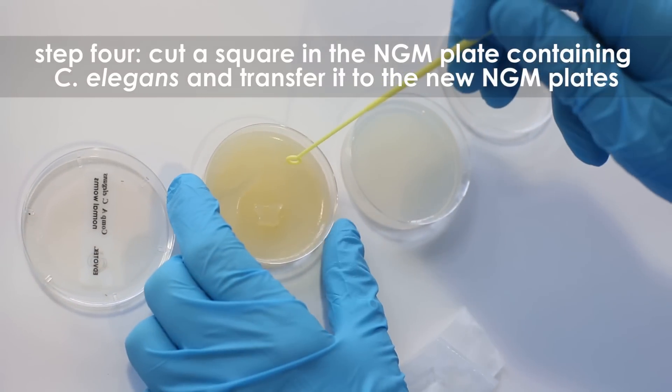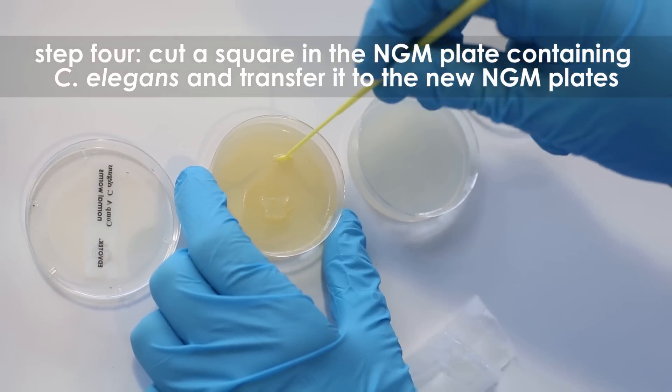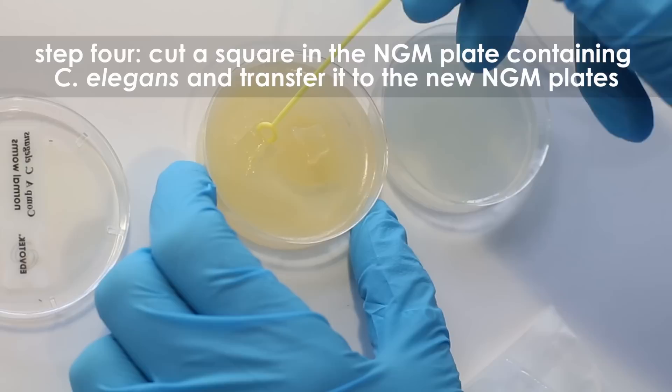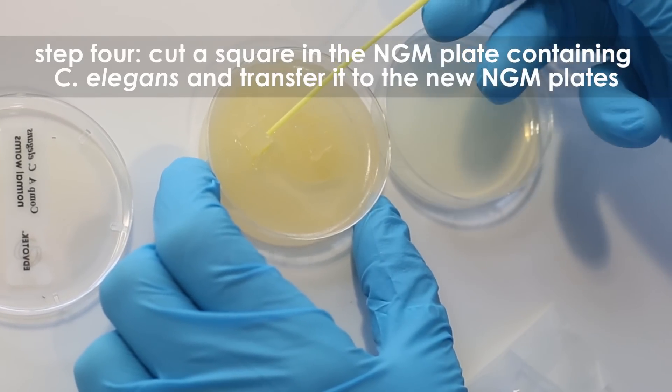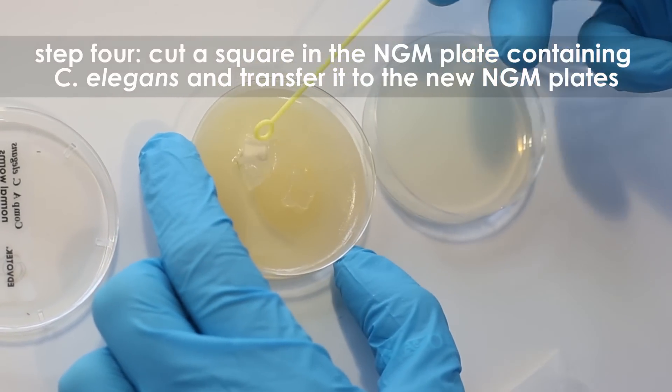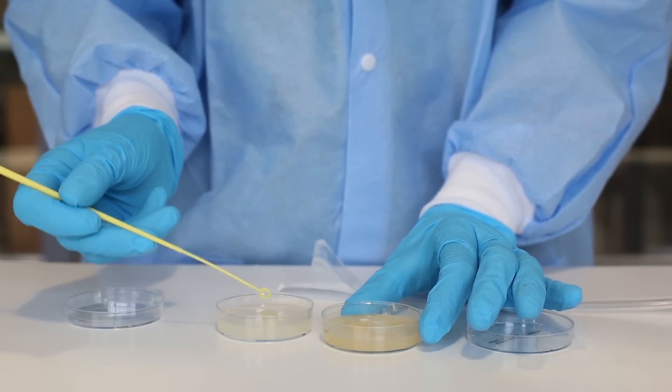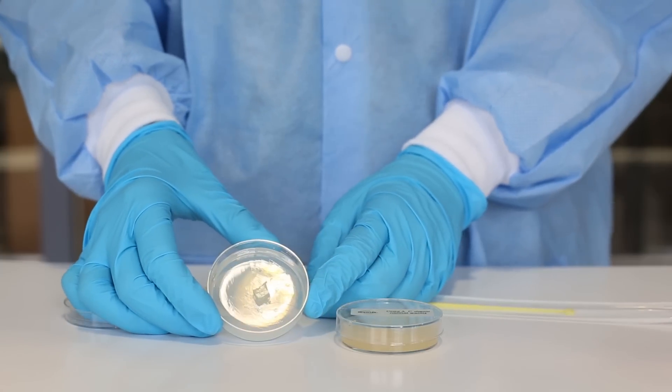Step 4: The next day, use a sterile loop to cut a small square of the NGM plate containing live C. elegans. Remove the chunk of agar from the old plate and transfer it to one of the newly inoculated NGM plates prepared in the previous steps.